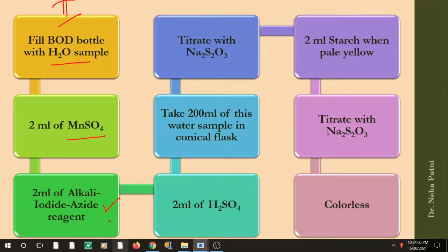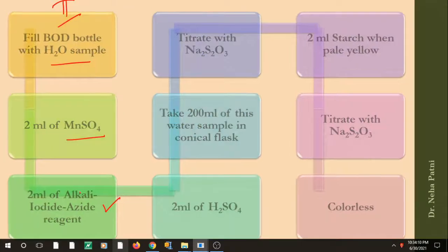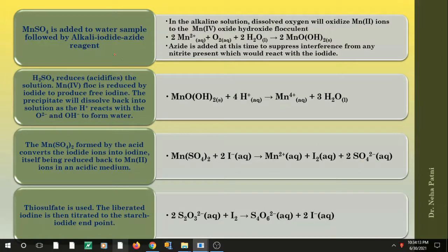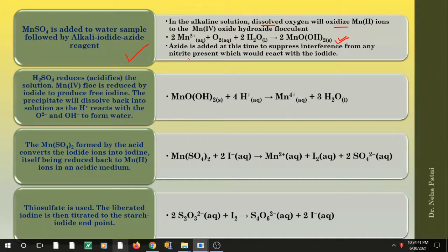Here is what happens: when MnSO₄ is added to the water sample and dissolved oxygen is present, the oxygen oxidizes Mn²⁺ ions to Mn⁴⁺ ions, forming a flocculent — an Mn(OH)₄ precipitate. The alkali iodide azide reagent is added because in the presence of alkali it reacts, and the azide suppresses interference from nitrite. If nitrite is present in the wastewater sample, it would interfere with the reaction and affect titration efficiency.